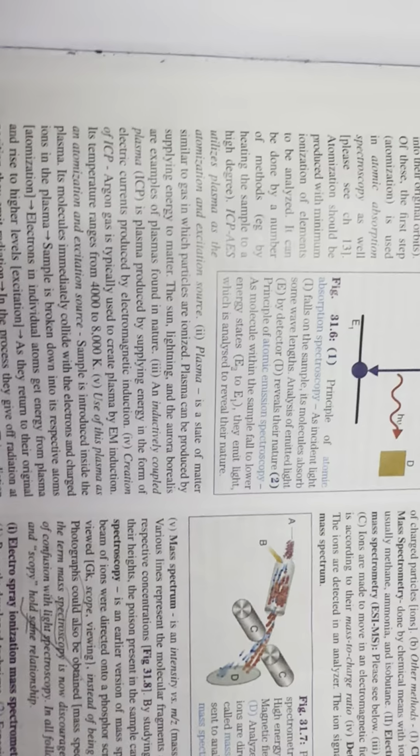Inductively coupled plasma atomic emission spectroscopy. Atomic emission spectroscopy is the reverse of atomic absorption spectroscopy. In this technique, wavelengths of light are studied which are emitted by atoms or molecules during their transition from an excited state to a lower energy state.